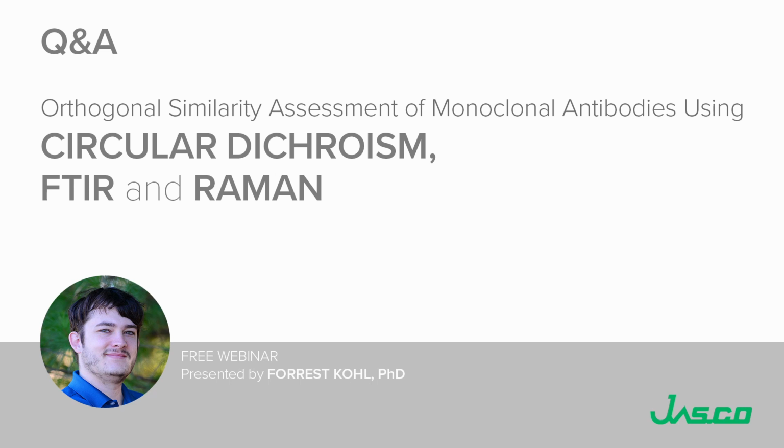Let's see, there is another question. I think I can answer this one. They say, can the software be used with data from non-Jasco instruments, for example, a CD or FTIR instrument from another manufacturer?